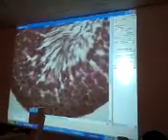So it's meiosis there. Somewhere down in this direction it's pretty hard to distinguish a primary from a secondary, but this zone should be secondaries mostly. By the time I get to the center, they start to change their appearance a little bit. These are spermatids. They're still more or less rounded cells, but they're losing their spermatocyte appearance, and then they become actual sperm cells and develop the tail. So from outside in we go spermatogonia, primary spermatocytes, secondary spermatocytes, spermatids, sperm. Yeah, exactly, from out to in.